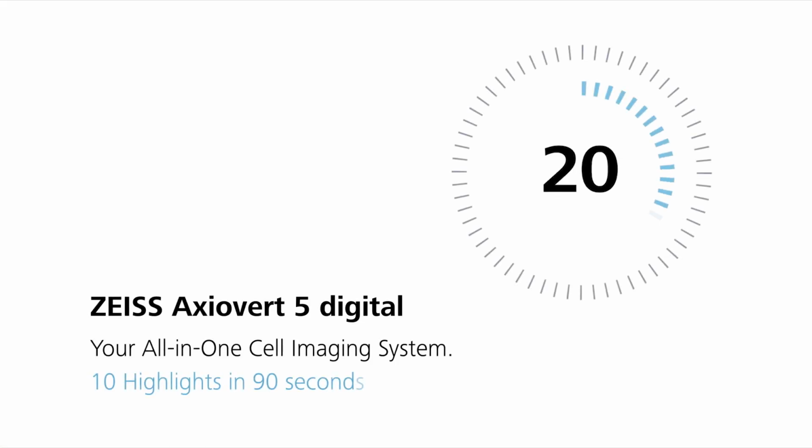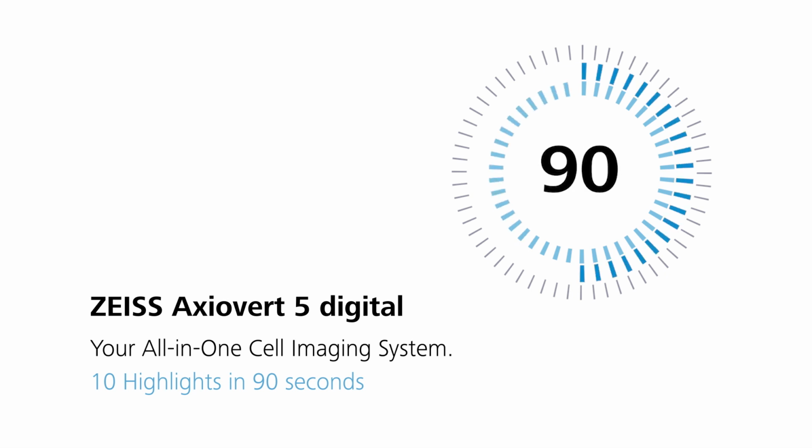ZEISS Axiovert 5 Digital. Your all-in-one cell imaging system. 10 highlights in 90 seconds.